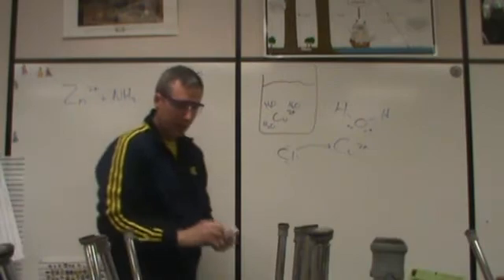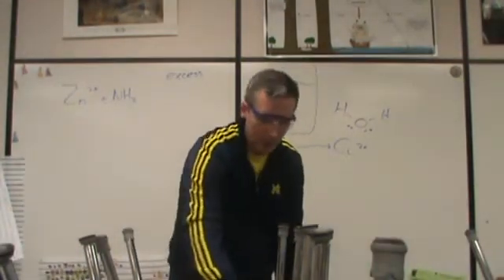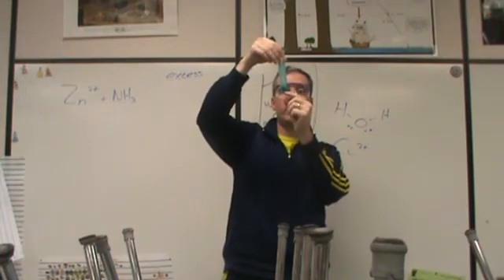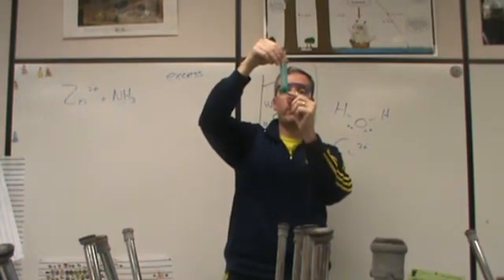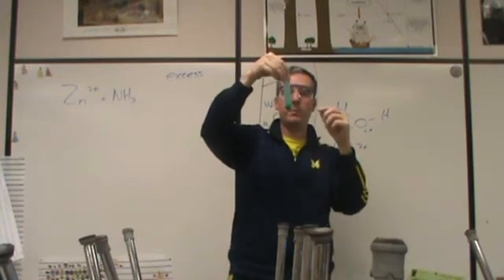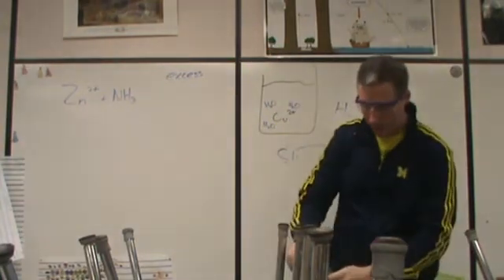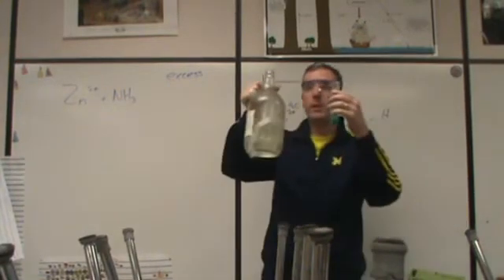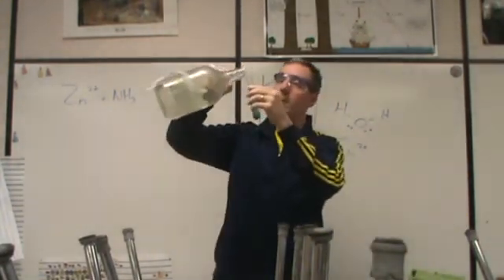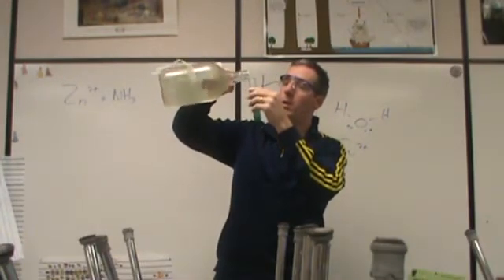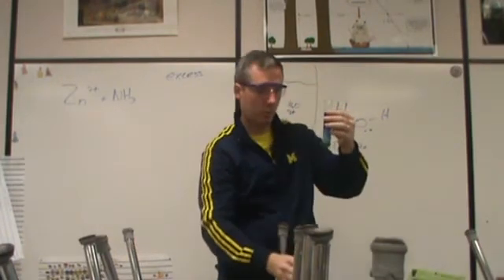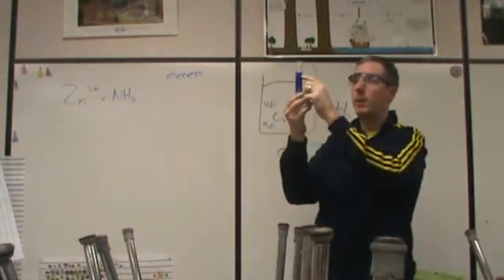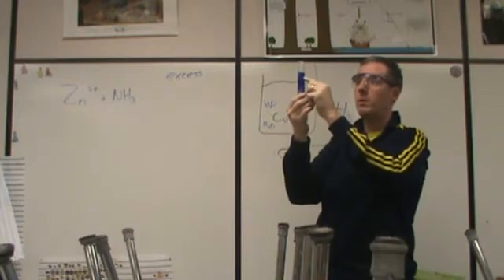So one of the examples of this, I'm going to take my copper solution, which currently has a little bit of that green color left at the bottom, but it's getting pretty faint. So this is the copper. It would be surrounded by chloride. And up here is copper surrounded by water. And what I'm going to do is I'm going to mix that with ammonia. So when I add the ammonia to this, the ammonia is going to displace those water molecules and it's going to surround the copper. And you can tell because you see a really rich blue color. So that right there is a complex. And what it is, it's ammonia molecules surrounding those copper ions.